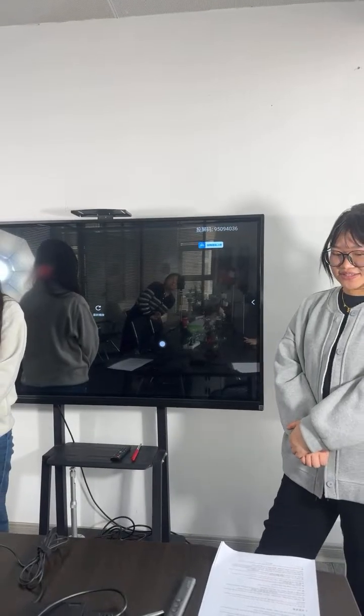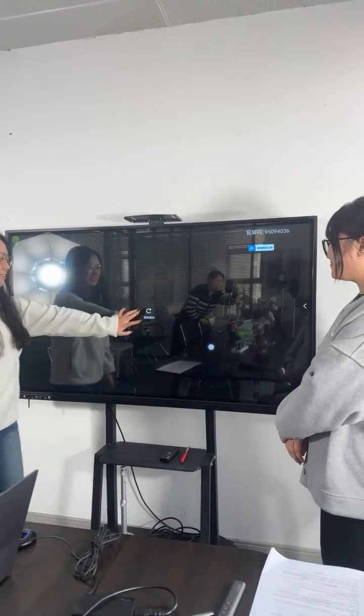Today, we will show you a video about the TBN value test. Here's my partner, Winnie. Hello everyone, my name is Winnie from Shanghai Minglan Chemical. This video uses the indicator method to test the base number. Let's watch the experiment.